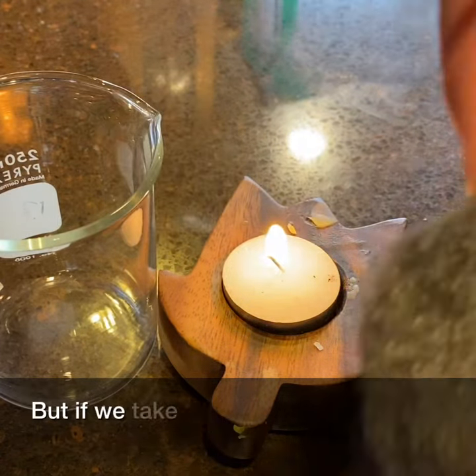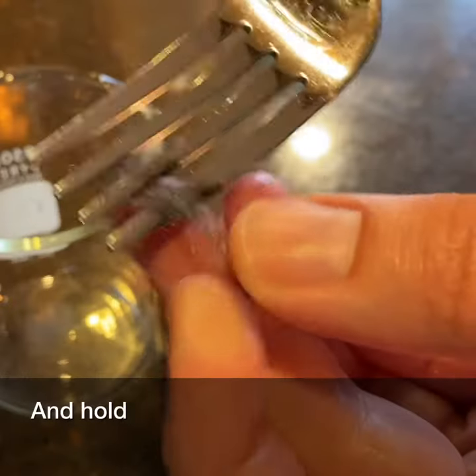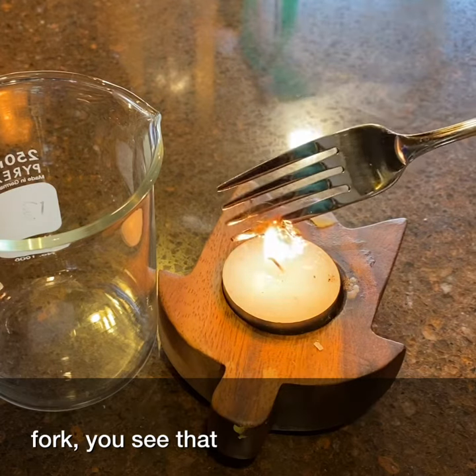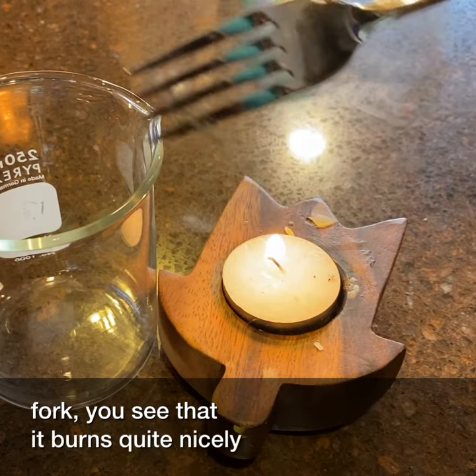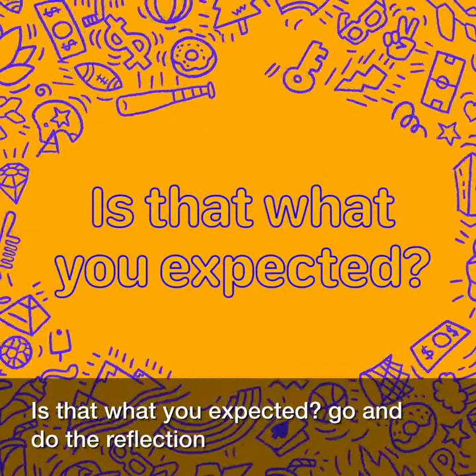But if we take this very fine steel wool and hold it over the candle using the fork, you see that it burns quite nicely and brightly. Is that what you expected? Go and do the reflection questions now.